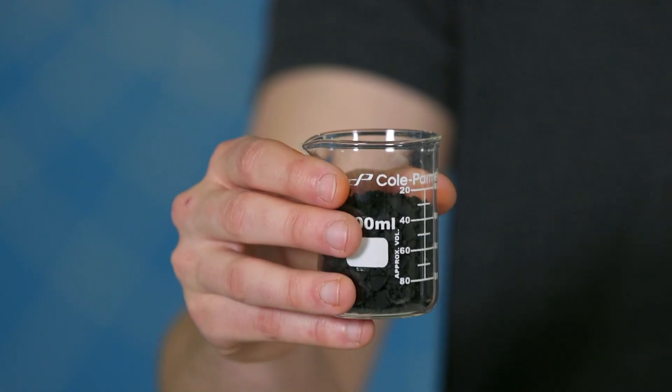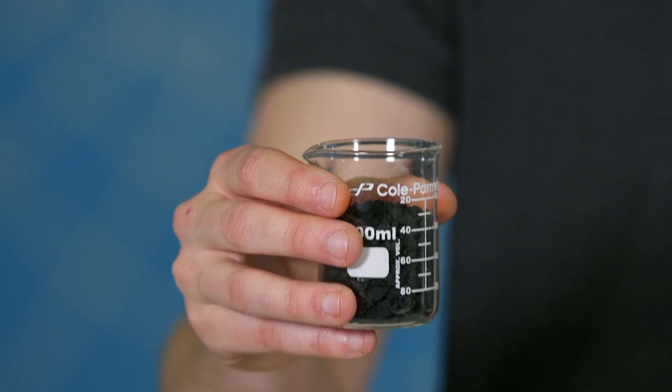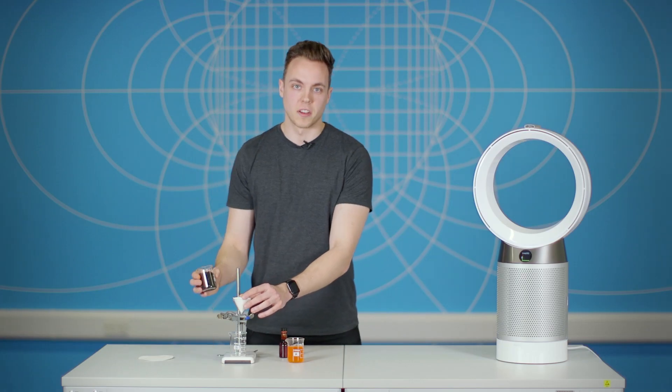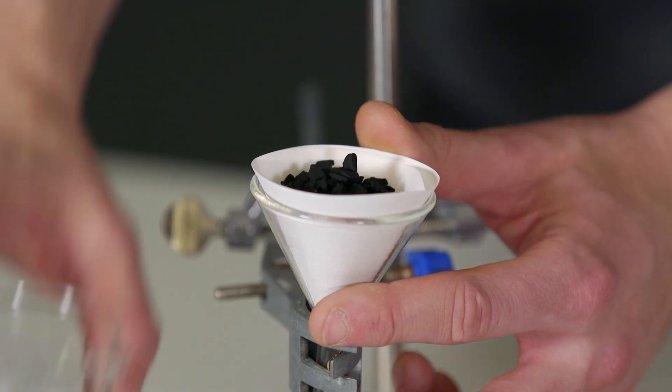These are activated carbon granules. You can't tell, but each granule contains an extensive network of microscopic pores. I'm then going to add some of the carbon to the filter paper inside the funnel. Around two to three teaspoons should be enough.